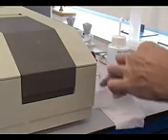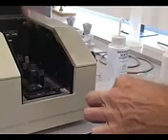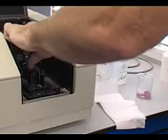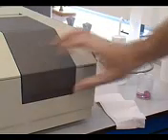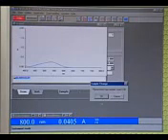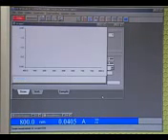Wipe the cuvette down to make sure there is no finger marks, and place the cuvette into the first hole in the UV-Vis spectrometer, still leaving 1 blank cuvette in the second hole. Now click Start to run the program, and this will acquire your data for you.